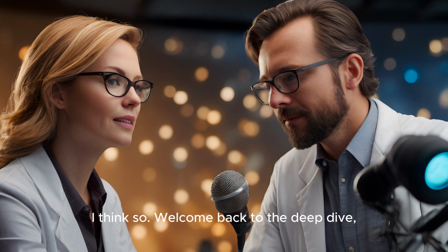I think so. Welcome back to the deep dive. Let's continue exploring how Sweeney, Wong, and Shalliker separated polystyrene isomers using different types of chromatography. All right, you left us hanging with the C18 and carbon-clad zirconia columns. What happened when they actually ran the polystyrene through these columns?